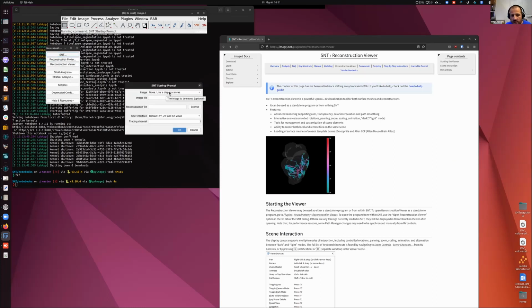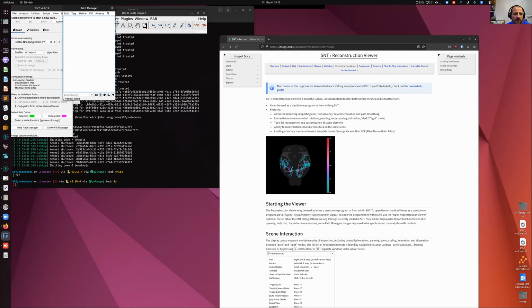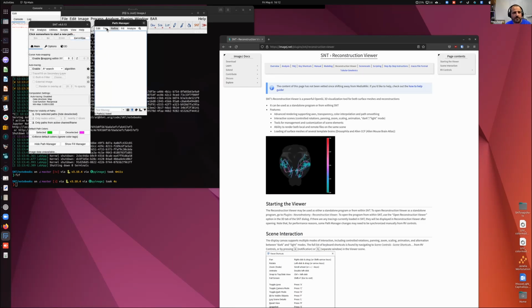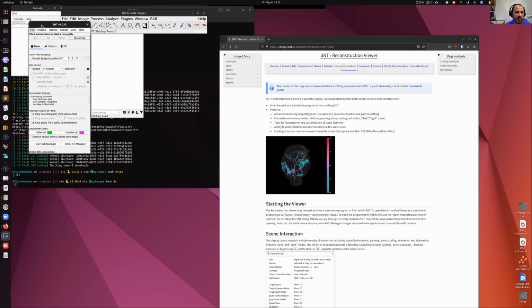It asks you what is the image that you're going to segment, that you're going to trace. If you don't have one, just say run, and then you can just read everything by default. You'll be able to change all that once you start. So that's pretty much the program. It's very discreet, there's not much sophistication to it. We try to maintain a good balance between simplicity and functionality.